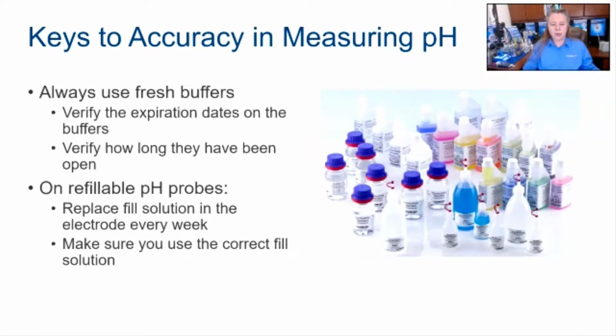Hamilton actually suggests that your buffers are good for 1 year after opening, but again, check your colors. Also, if you don't rinse your probe from one solution to the next, and you're actually putting your probe in your buffer bottles, you can contaminate your buffers, and so you may need to replace them more quickly. These should be considered stock solutions and always poured into another container.